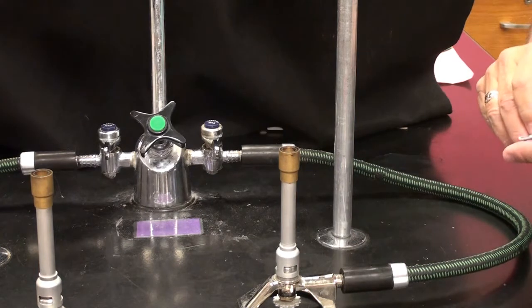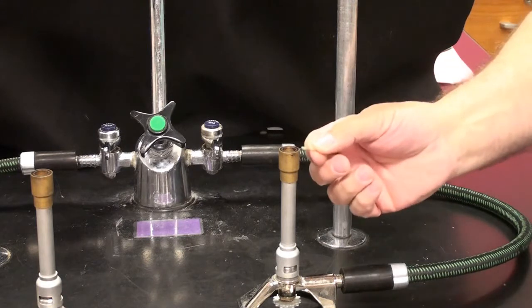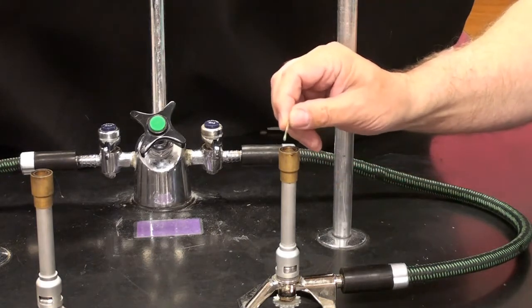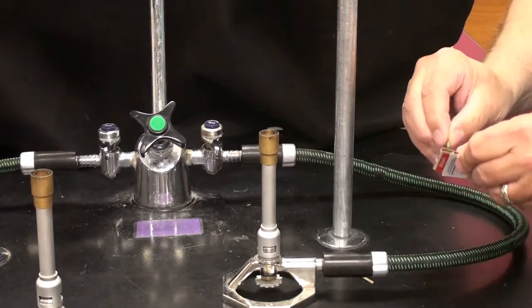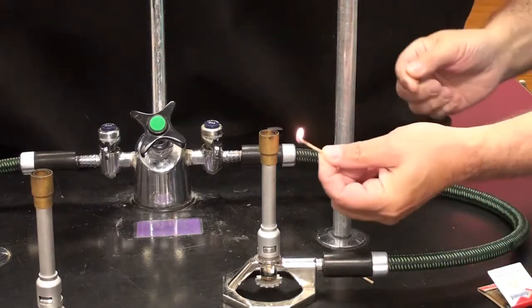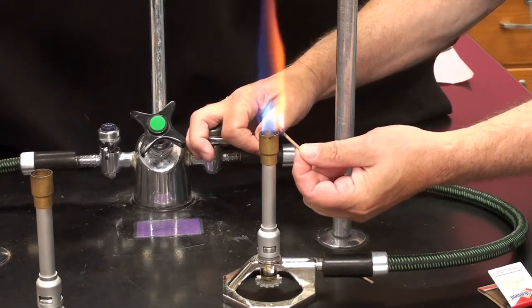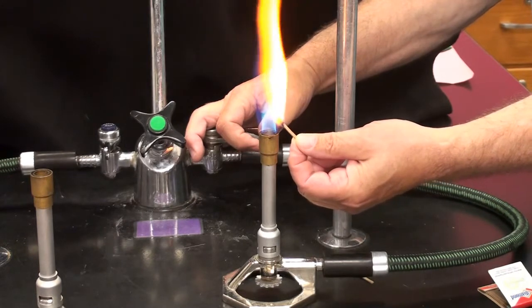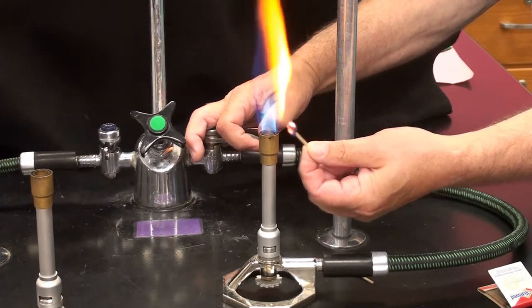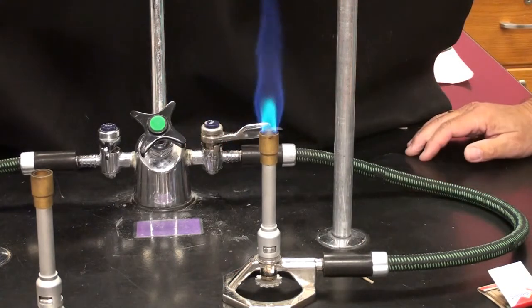And when you want to light this, I light it by holding the match on the side. I don't want my hand anywhere above it. I want it to be on the side here. So I can light my match like so, hold it on the side, and then slowly turn on the gas. And there we are. See? My hand's still there. I'm not getting burned or anything. And we got the Bunsen burner going.